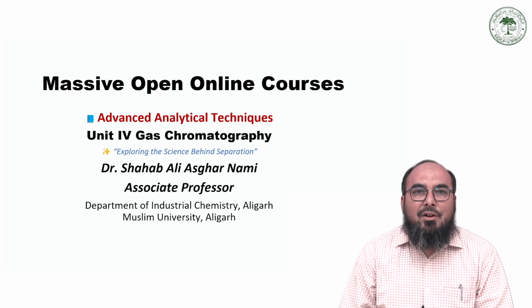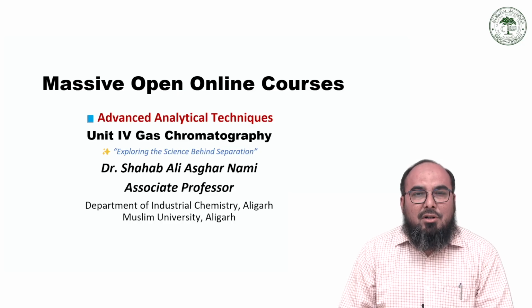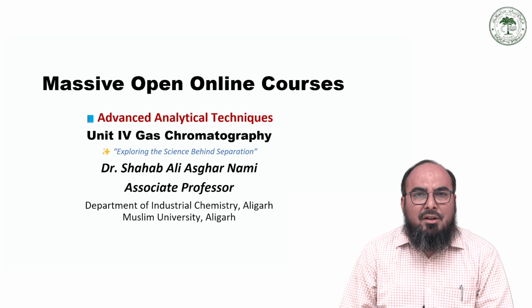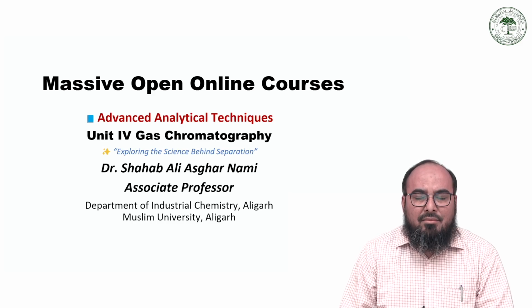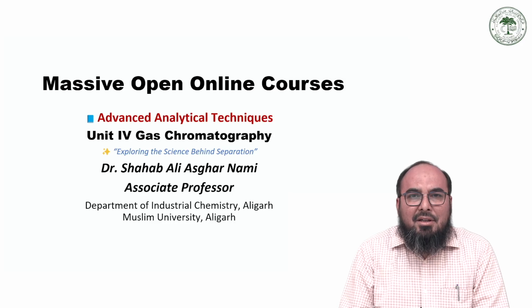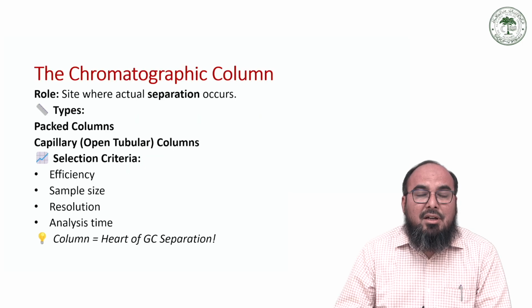In the previous slide, we introduced the concept of gas chromatography, and we also covered its basic principle. We have also seen the various important components which constitute a gas chromatograph. In addition, we studied the concept and importance of carrier gas, and then we discussed the flow meter, its importance in a gas chromatograph, and how the flow regulators have an impact.